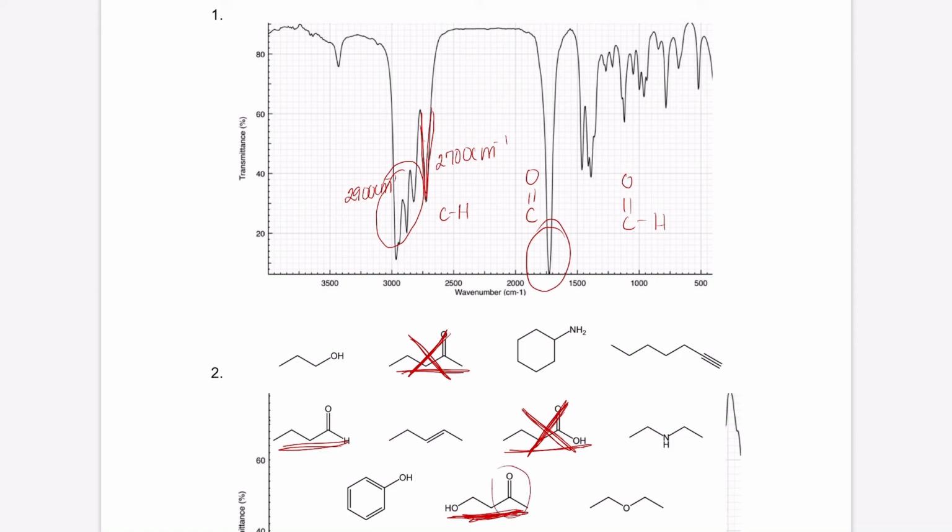It just contains a ketone and an alcohol. So if this structure were to be the first spectrum, then we would have to have a really broad band around 3300 to represent our alcohol. So that's how we can prove all of these answer choices wrong. And that's how we know that this aldehyde corresponds with question 1.